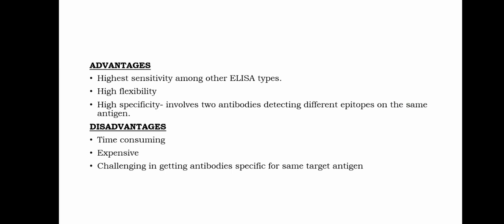Advantages of sandwich ELISA: highest sensitivity among the other ELISA types, high flexibility, high specificity. It involves two antibodies detecting different epitopes on the same antigen. Disadvantages include: time consuming, expensive, and challenging in getting antibodies specific for the same target antigen.